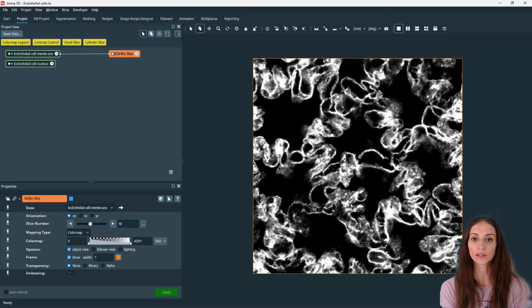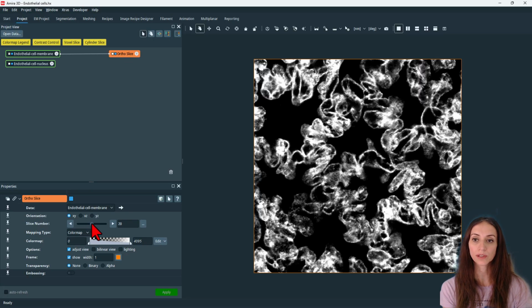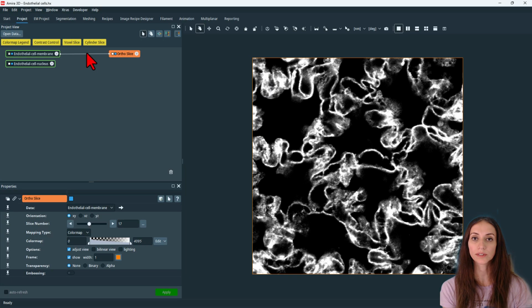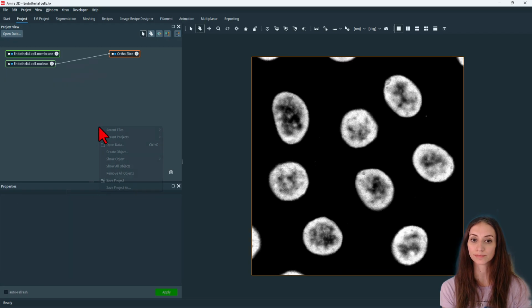In this tutorial, you will learn how to use the multi-channel field to combine and manage grayscale images within a single dataset. In this dataset, acquired using fluorescence microscopy technology, nuclei and membranes were detected using separate image channels. The multi-channel field will be used to link them together.